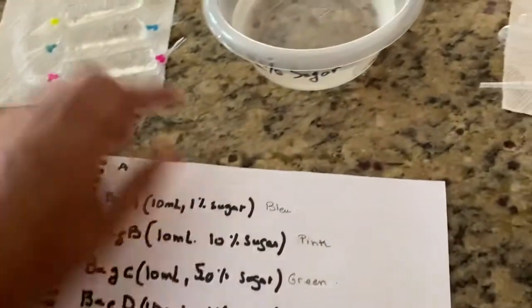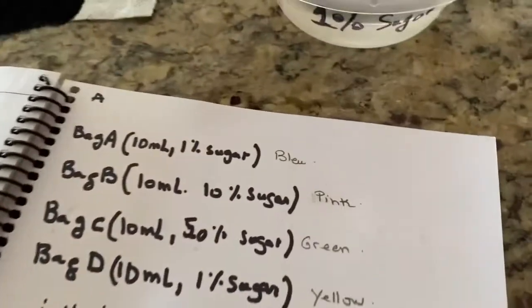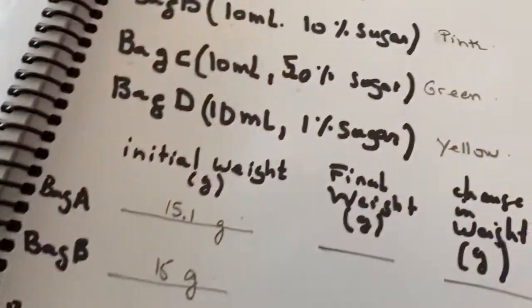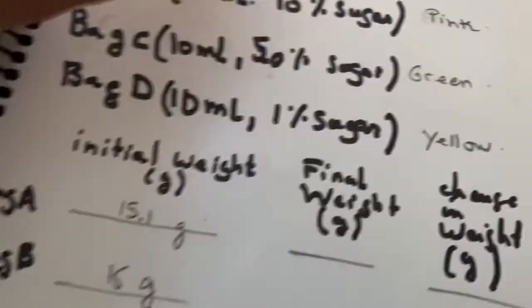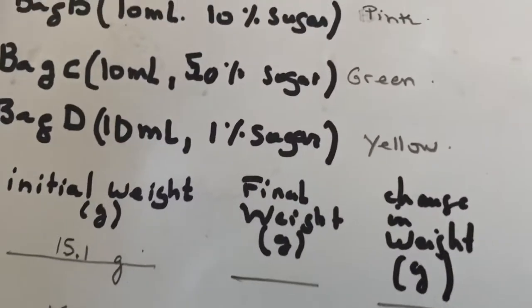Bag A is my blue one, which has 1% sugar, and this is 1% of sugar, so it's going to be the same. So it's going to be isotonic for it. We are going to verify that. Bag B, it's the pink, put it in. And bag C, it's the green, put it in. And we are going to leave it for 30 minutes.